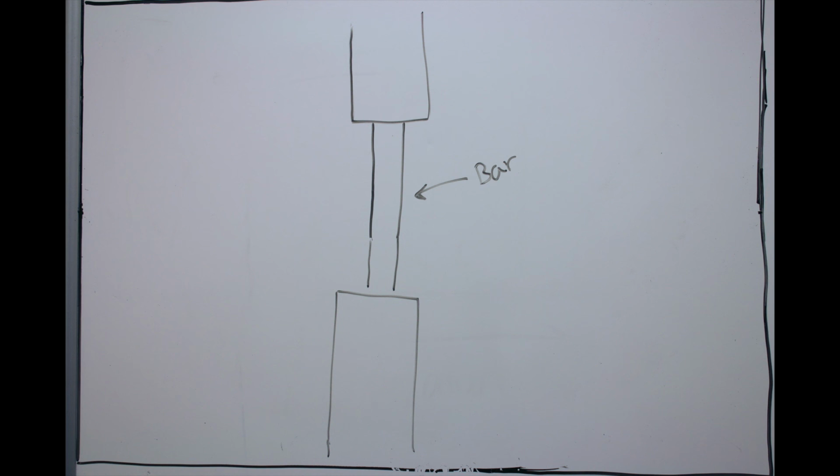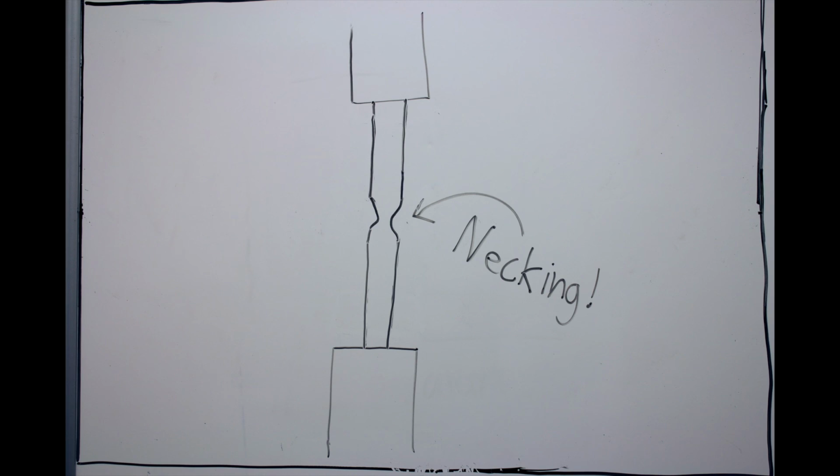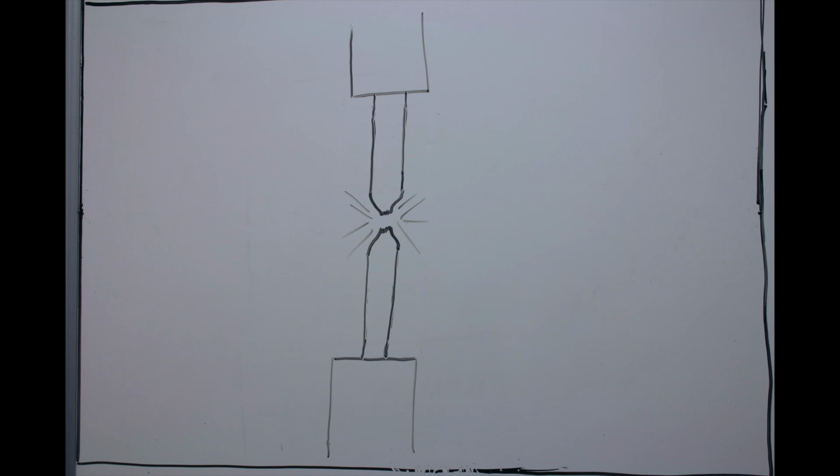In tensile testing, a varying load is applied to a test sample up to the point of failure or predetermined criteria, creating a stress-strain curve showing how the material reacts throughout the test. The data provides information about the tensile strength, strain, modulus, and ductility of the test material.